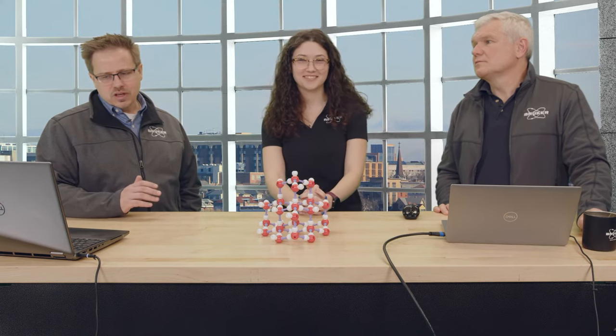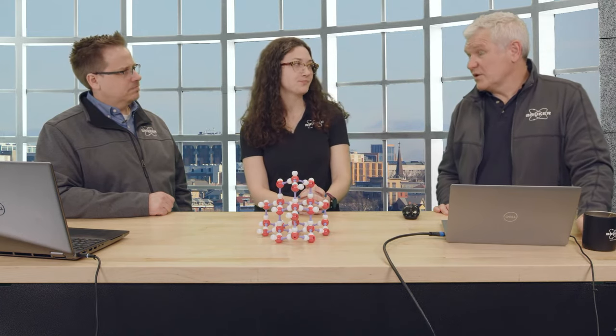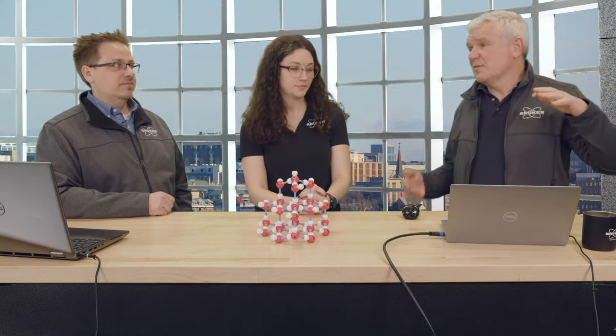Next from Moises Bravo: in integration with a Q vector, should I skip my fast scans? It really depends. Often with these modulated structures, you need a very high dynamic range because the satellites can be very weak, and you also have to look at the very strong reflections. So there's no reason to skip the fast scan. You will spend more quality time with a material like this and not typically just collect one data set. Maybe you can optimize the exposure time. Often what I do is collect two data sets that I merge: a very long exposure to really enhance the quality of the satellites, and then a regular data set that focuses more on the main reflections.